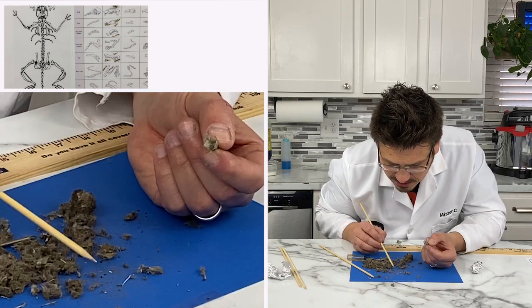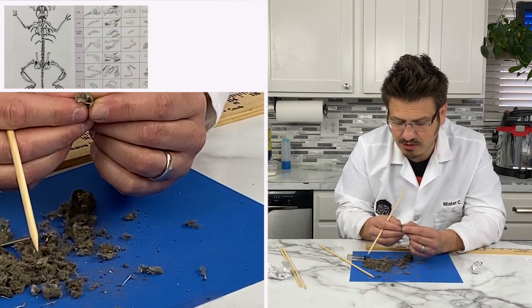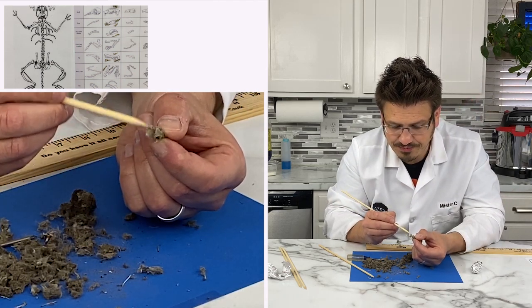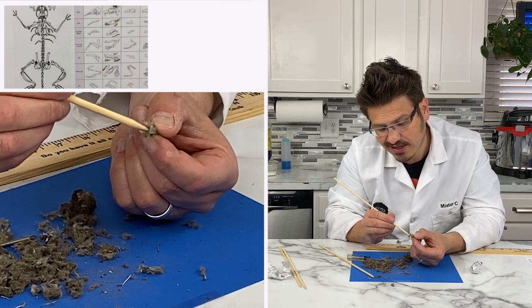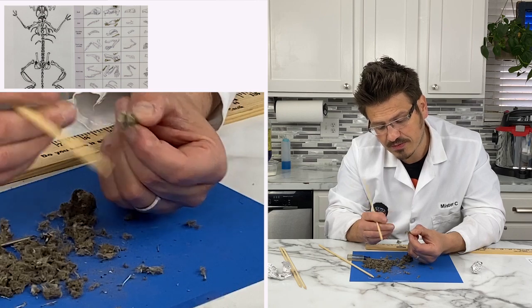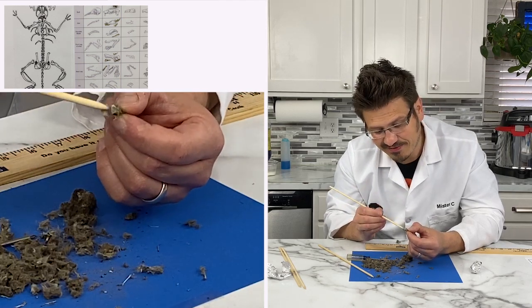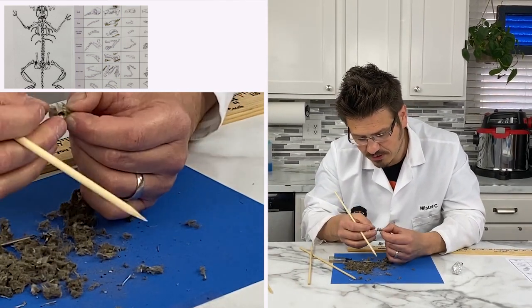But what I'm really interested in is that I haven't seen any vertebrae. Typically after these owl pellets, you have enough vertebrae to actually build the entire skeleton. What we would do sometimes is take a transparency sheet, glue the bones onto it, and then build a skeleton. I might get another one. One's a little sharper. There we go.